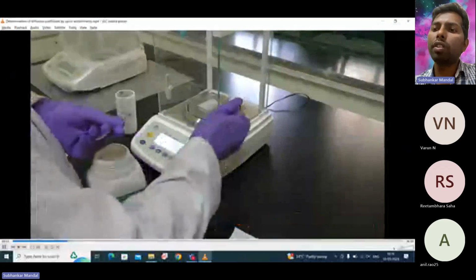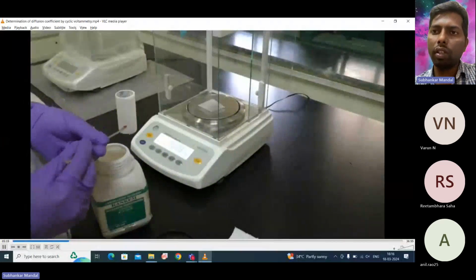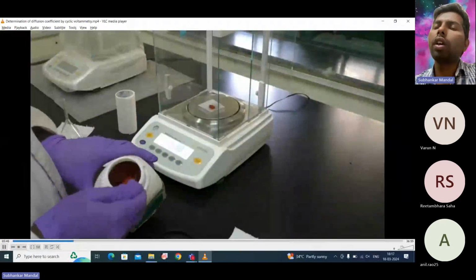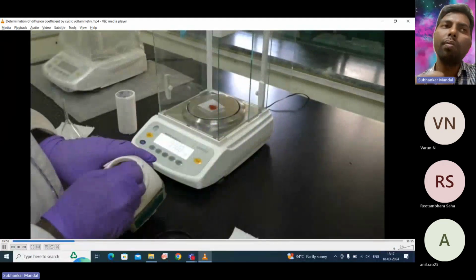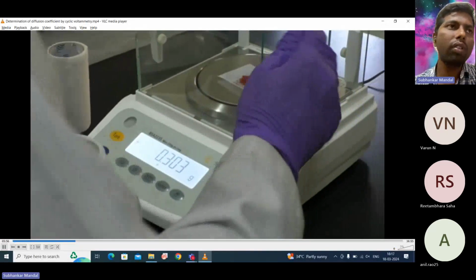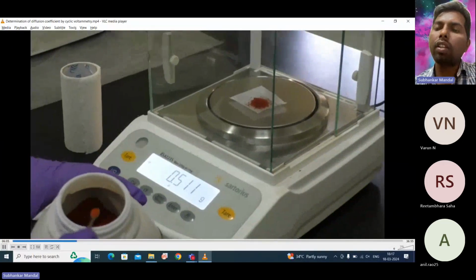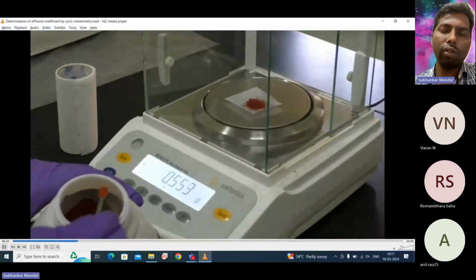For that you need 0.658 gram of ferricyanide, which is a brown colored compound. From here we will make different concentrations of ferricyanide, and from there we will measure the cyclic voltammogram for different concentrations of the compound. Okay, and step by step I will show what the electrochemical cell is, and how the working electrode, reference electrode, and counter electrode look.